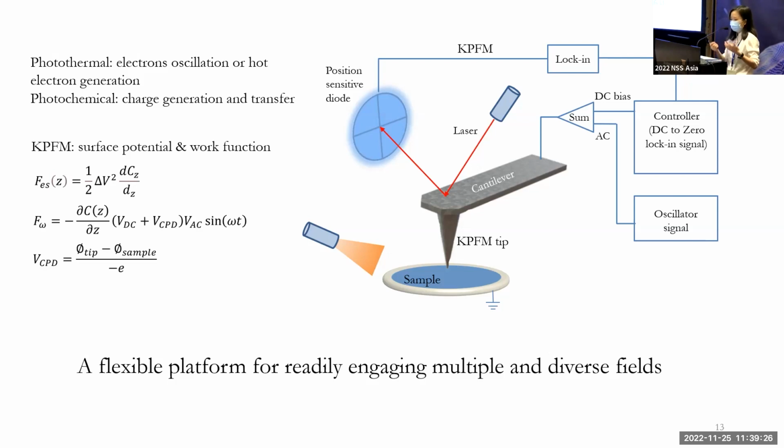Luckily, SPM techniques are a really flexible platform where we can easily engage multiple and diverse external fields to study the material's response to these fields.